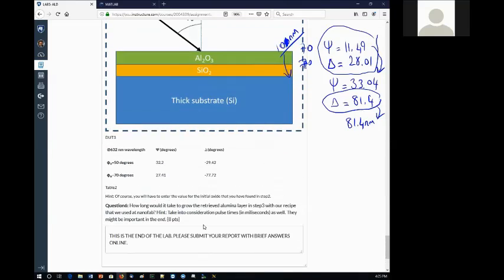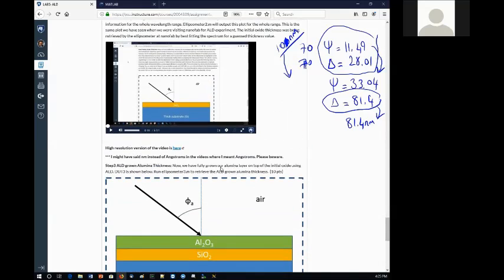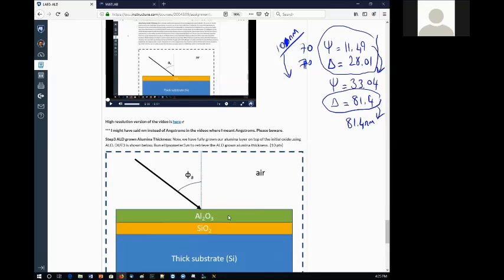Okay, in the end, as I was emphasizing, ALD gives you the ultimate control, and you can see the control thanks to ellipsometer measurements like this. It will be able to measure to the angstrom level, okay? So you will definitely tell the thickness of a layer at the angstrom level. So that's very critical.